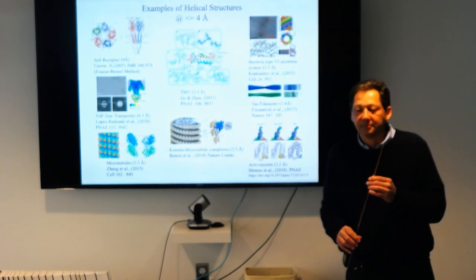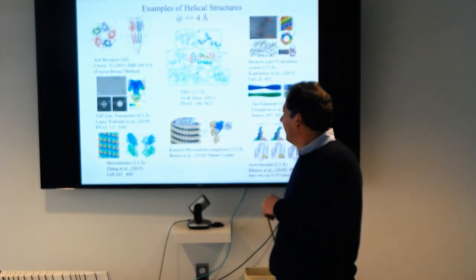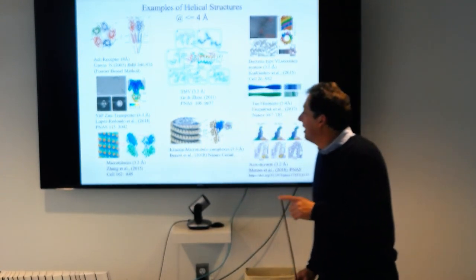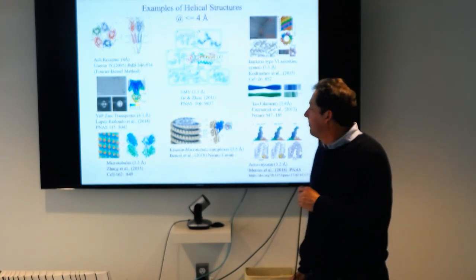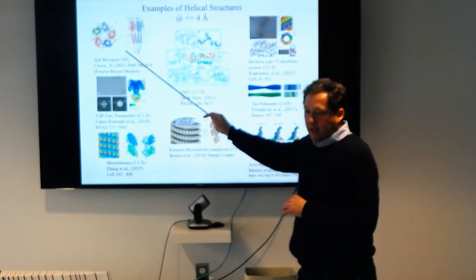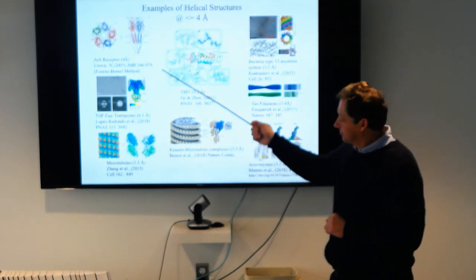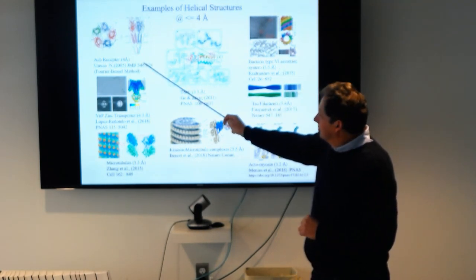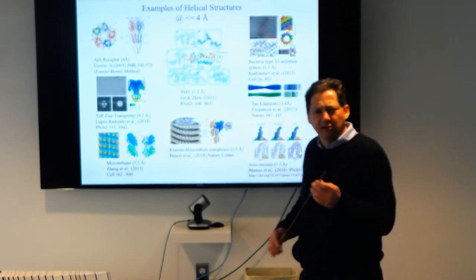Do most of those reconstructions utilize in-house custom scripts, or would you be able to do that with out-of-the-box Frealign or RELION? Well, I think that's definitely very much in-house. You can ask. I don't think you can even get the exact method of that, or maybe you have it here, don't you?